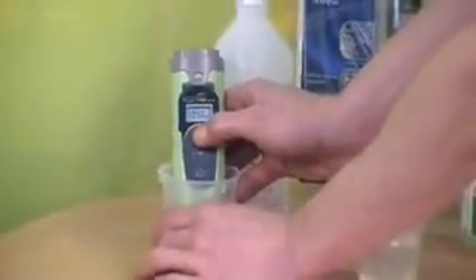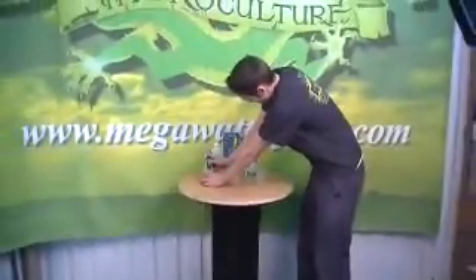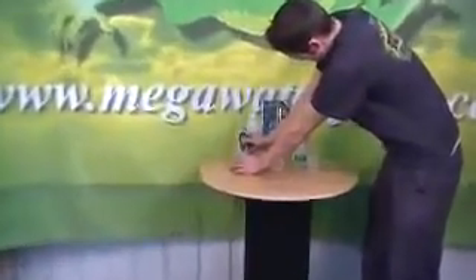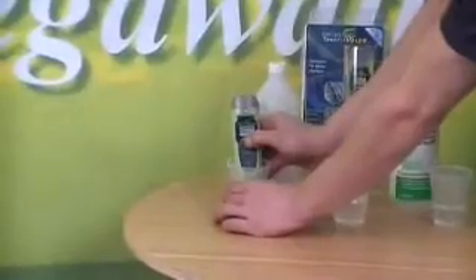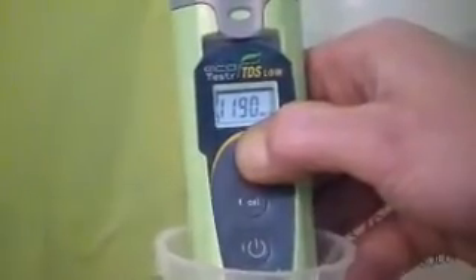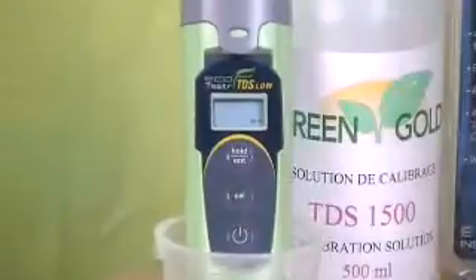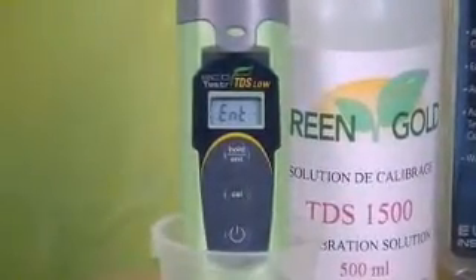It might take a little bit of time. Almost there, not much longer. Once you have adjusted it to 1500, you let it sit for a bit until it stops flashing, and then your pen should be calibrated.